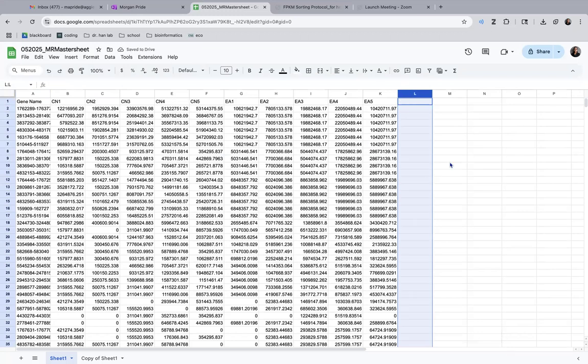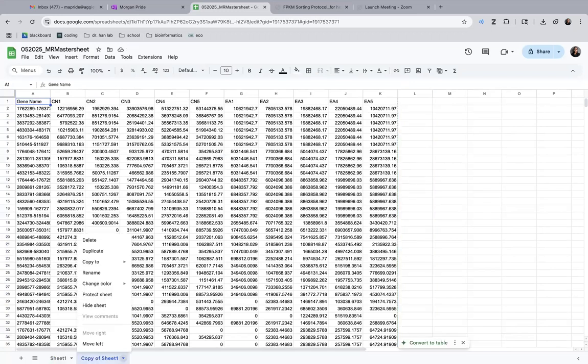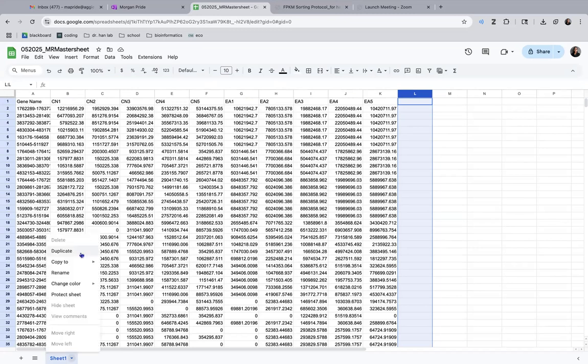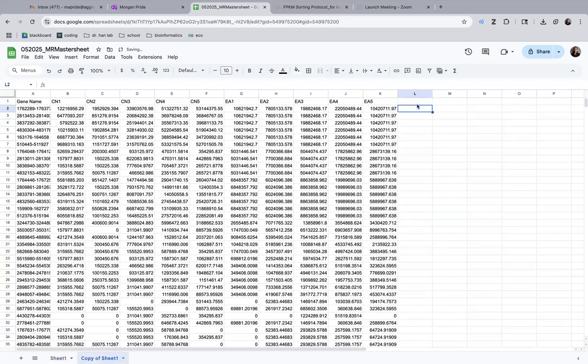What I forgot to tell you is that for the next one, when we first paste the data over for the normal tissue and then the European samples, we need to paste them and then make a duplicate copy to then do the math column one. That way we have a copy to go back to just in case anything messes up.